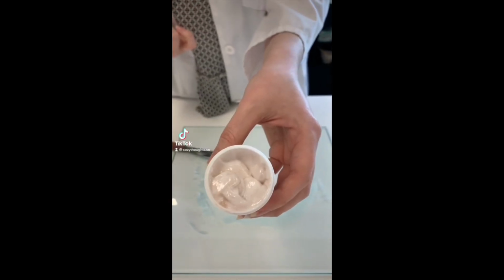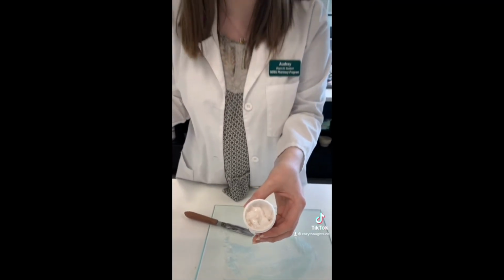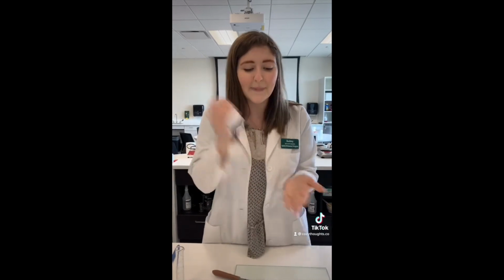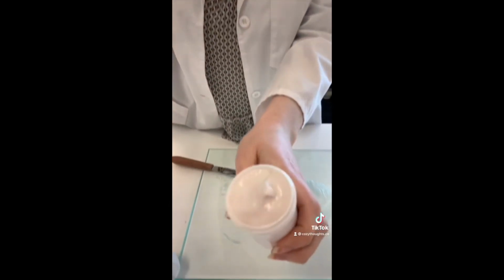You can see this doesn't look great because it's kind of an amorphous blob, so we wouldn't want to give this to a patient. So what we do is put the cap on, then bang it against our hand a couple of times. And if you take it off, it looks like a little dollop.